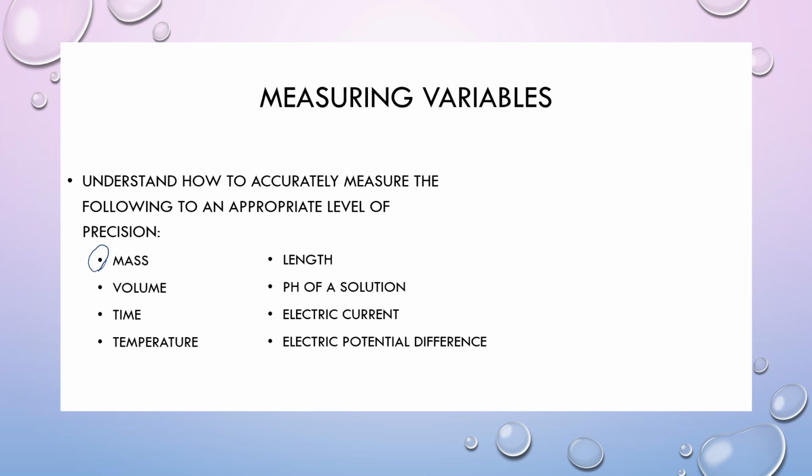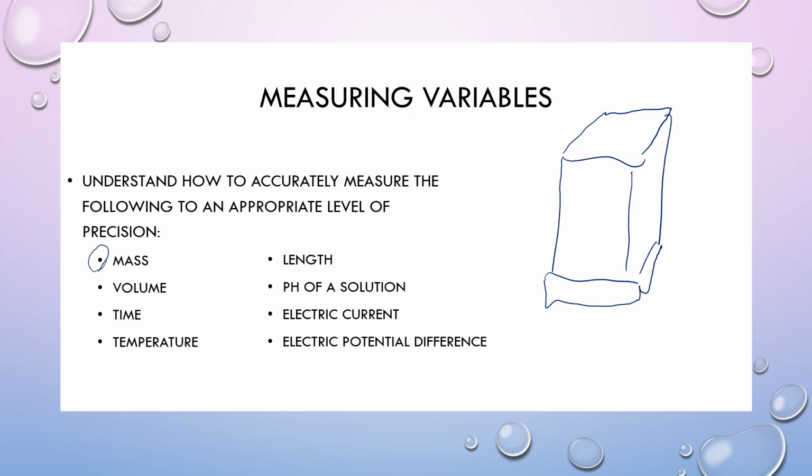And different balances are going to have different numbers of significant digits that are available. Typically, you'll see something like an analytical balance will have like a cage around it. I don't know what else to call it, like a shield. And that's there to prevent like air currents or dust from affecting your measurement. And usually they'll have like sliding doors. Sometimes it's a sliding lid on the top. And you want to make sure that it is completely closed when you zero.